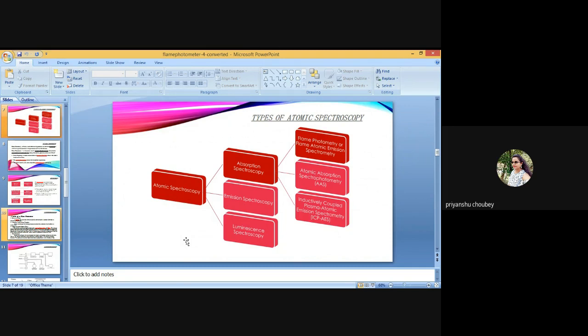Plasmas are noted for a relative freedom from chemical and ionization interference that are common with AAS. Detection limits are equal to or better than AAS depending on the element to be analyzed, and elements such as aluminum, phosphorus, sulfur, and boron, which are poorly measured or not measured at low concentration with AAS, are readily determined with higher sensitivity by ICP-AES.